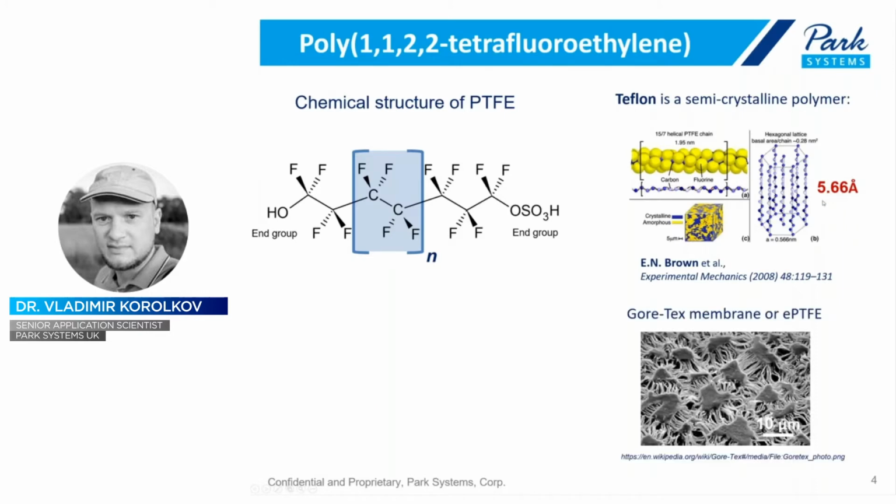As I said, the polymer is extremely widely used for all sorts of applications. Just to name a few, everyone is very well familiar with the Gore-Tex membrane, or so-called expanded PTFE, the polymer that was invented by Bob Gore and used in all sorts of applications, from raincoats to shoes and so on.